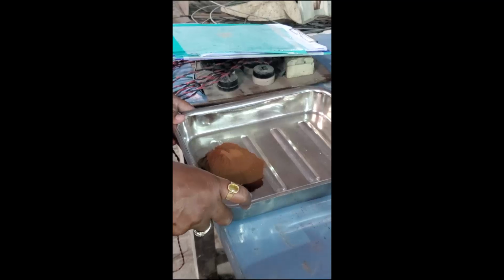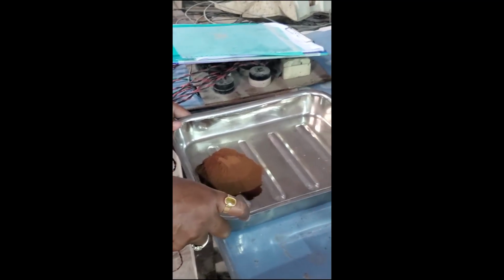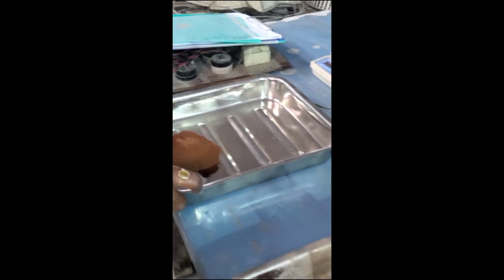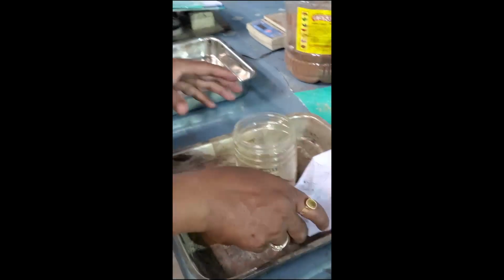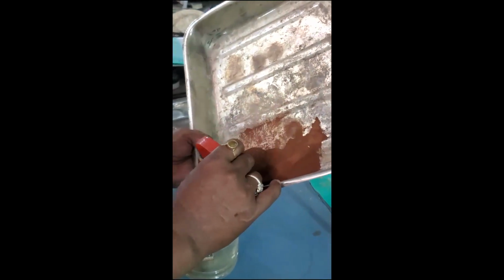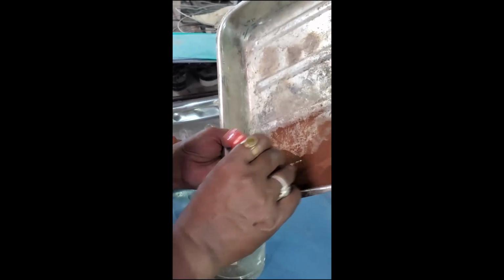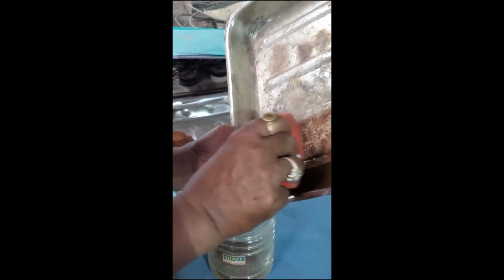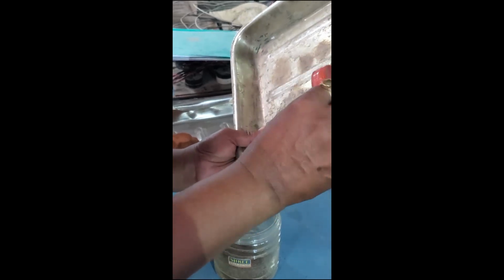This is the first tray. We are not adding any bentonite, so mixing is not required here. Now we are coming to the second tray. In the second tray, we have iron ore and 1% of bentonite, that is 2 grams, which we added. For better mixing, we are putting both iron ore and bentonite in one container so that it will mix properly.